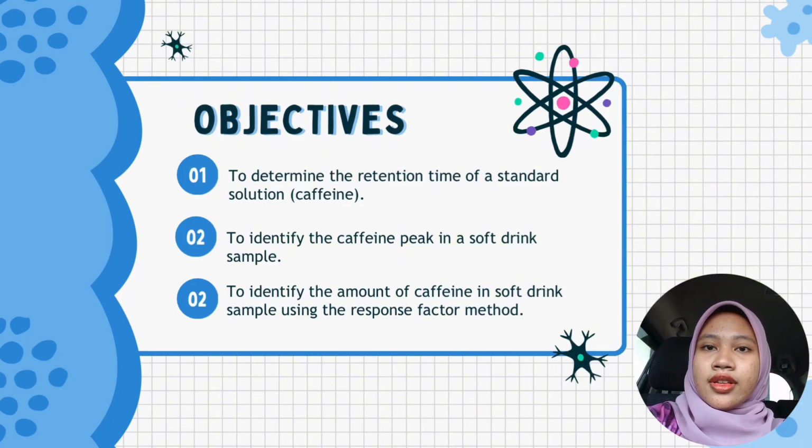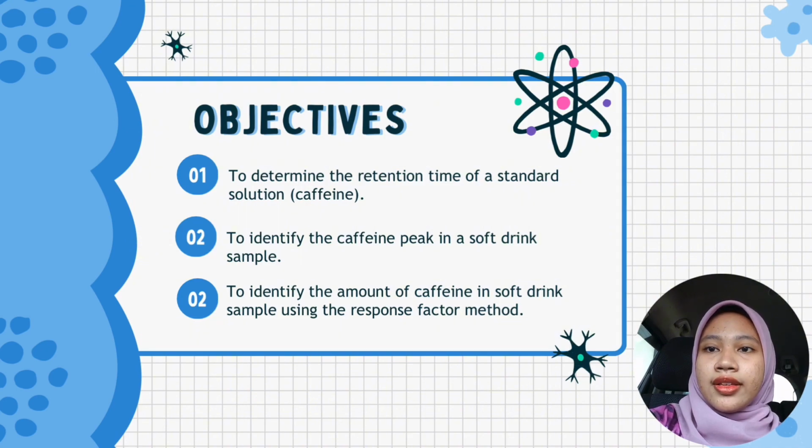Objectives. First, to determine the retention time of a standard solution, caffeine. Second, to identify the caffeine peak in a soft drink sample. Third, to identify the amount of caffeine in soft drink sample using the response factor method.